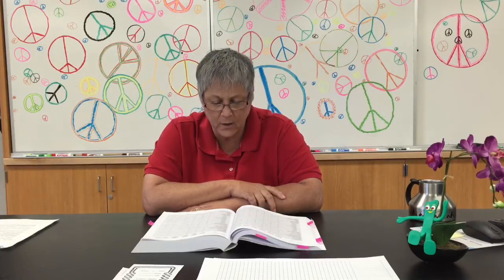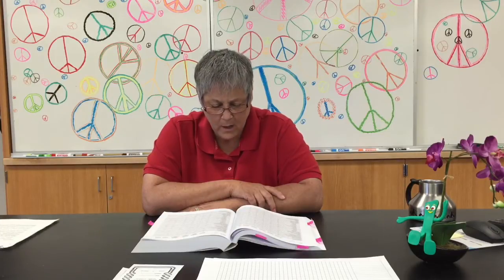Deoxyribonuclease at 25 degrees Celsius, that's the DNase test. Not typically very useful for gram-negative unknowns, might be useful for a gram-positive unknown. Let's see, and then catalase production is down near the bottom of the page, and then oxidation fermentation test. If you have a gram-negative unknown, I don't know that that one's going to be terribly useful to you. Pretty much all of them are going to be fermentative for that test. Okay, so anyways, you're going to get information from the Bergey's manual, transcribe it onto your checkerboard matrix, and then you're going to be ready to start writing your flowchart.